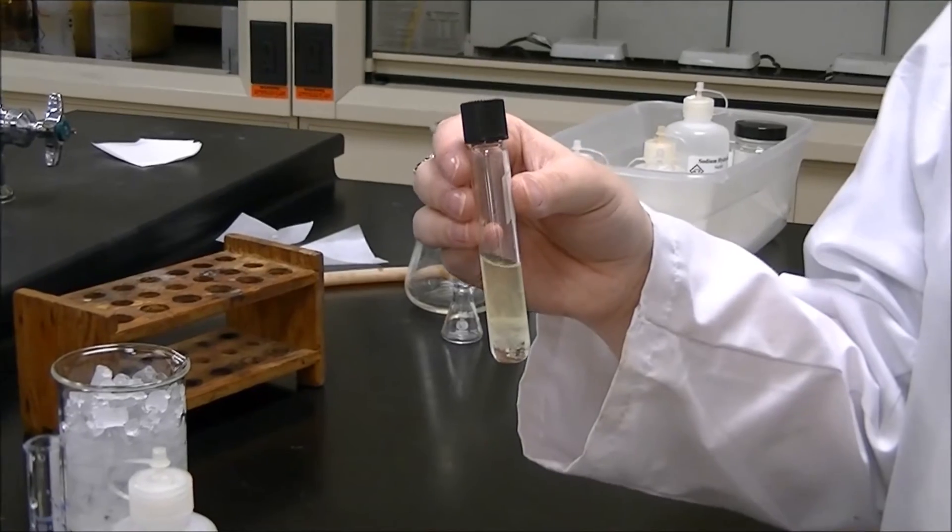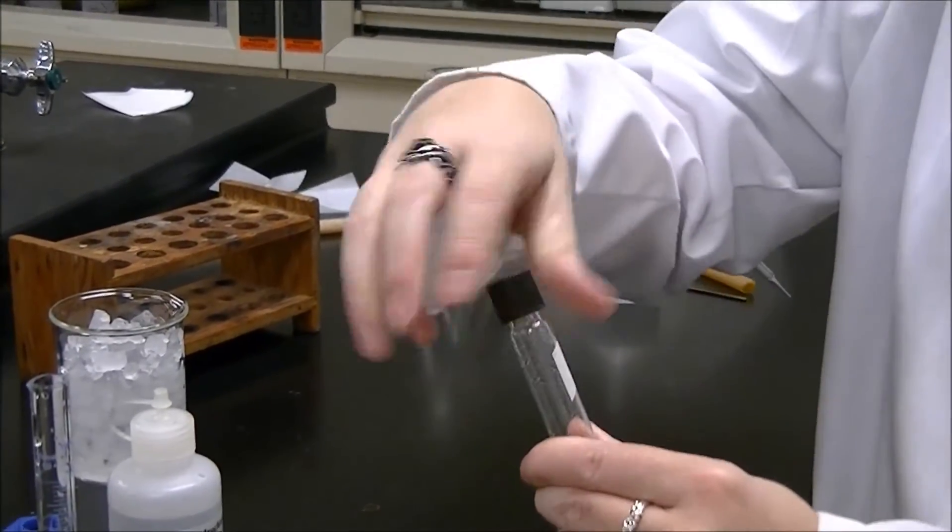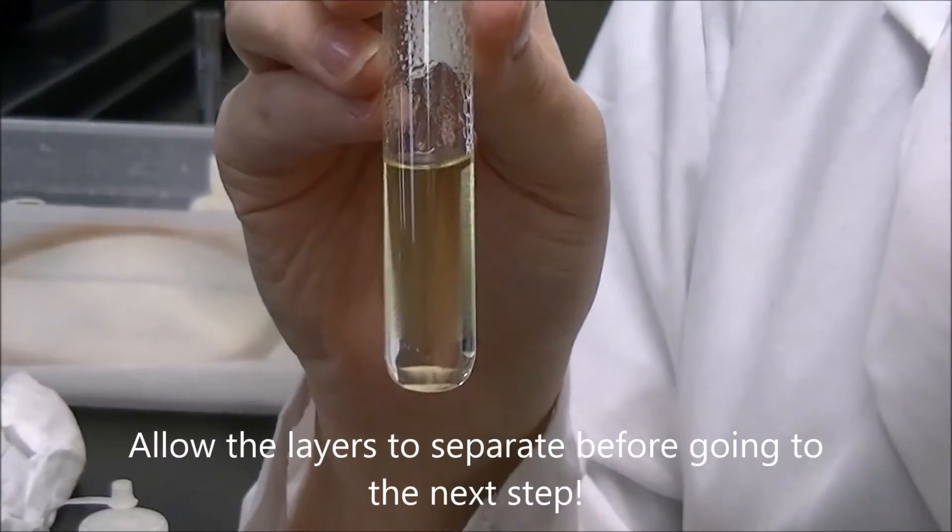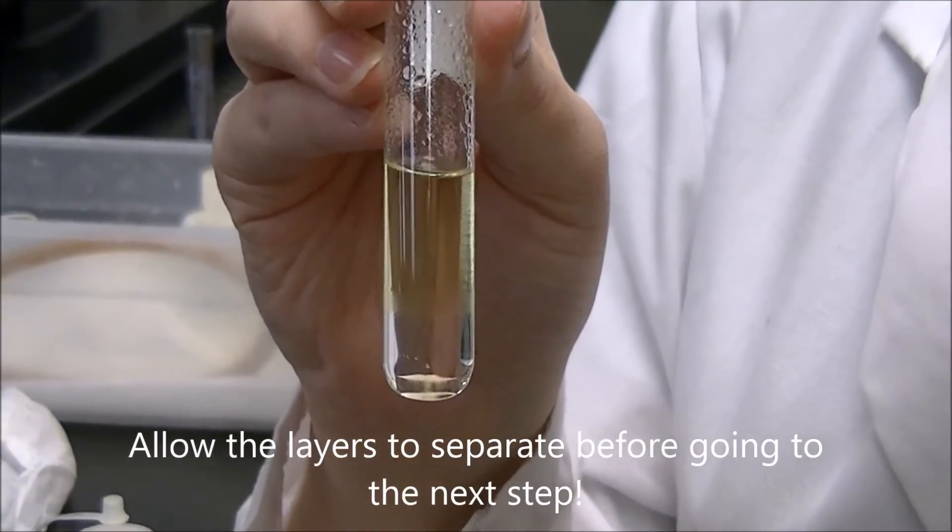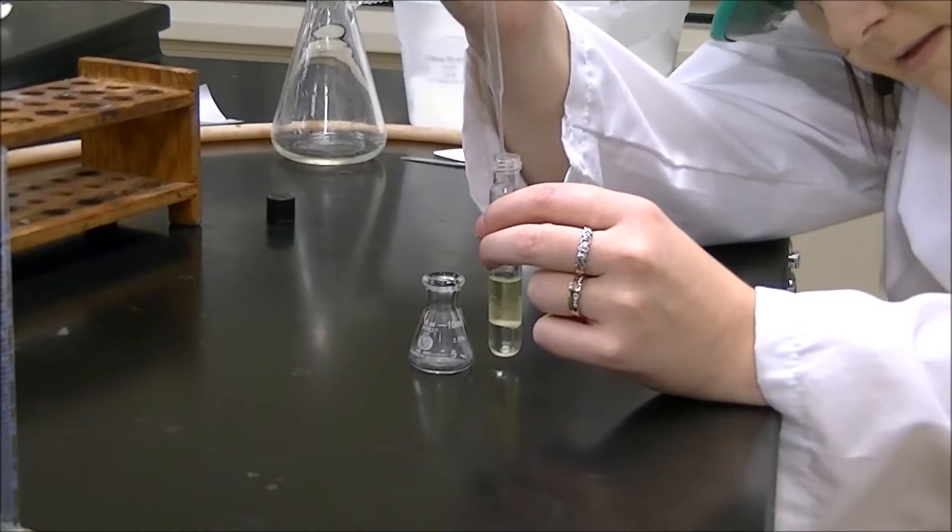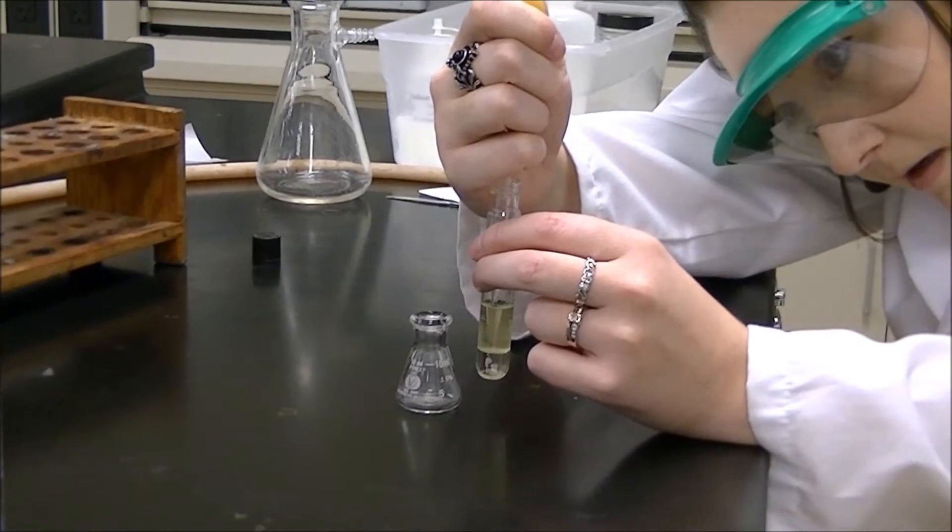Once you've added your acid, invert with venting. Remove the bottom aqueous layer and place in a 10-milliliter Erlenmeyer flask.